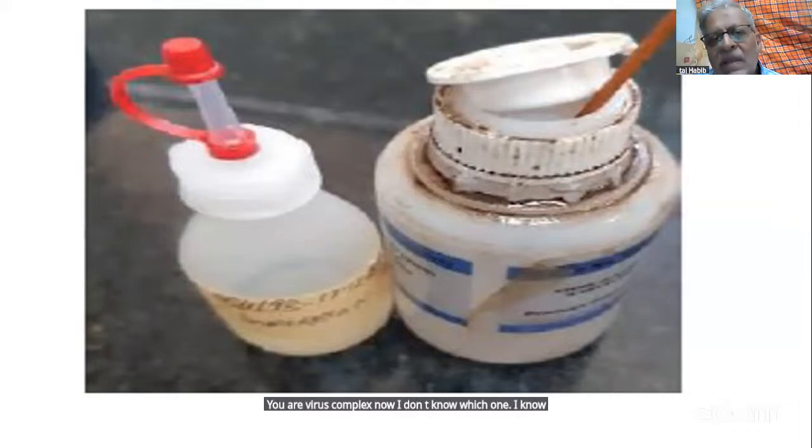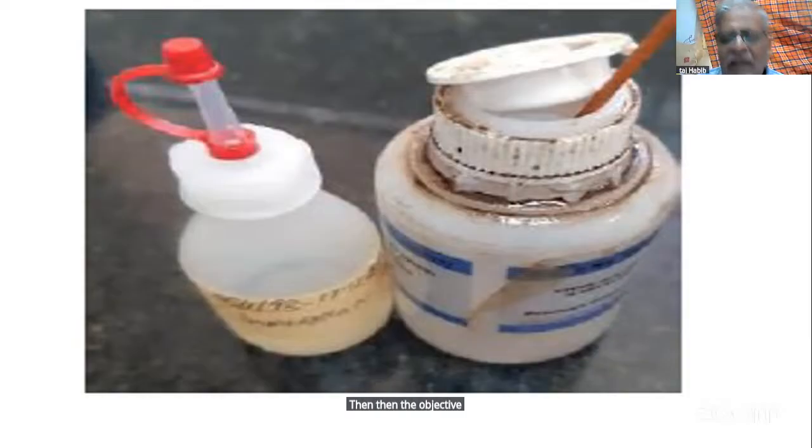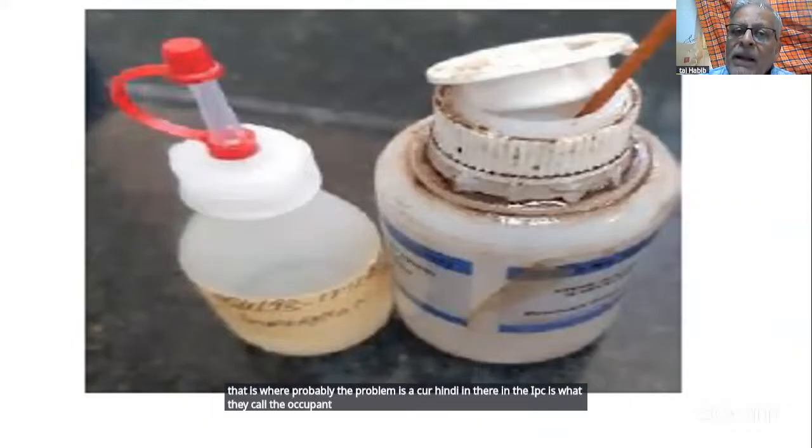Either the eyepieces, there are two lenses in your eyepieces. Then there is the objective. Then inside the objective, there are again some lenses. That is where probably the problem has occurred, in the eyepieces, what they call the ocular. So it is possible that you are not covering the microscope at night. I'm not saying you are being negligent. I'm saying it is possible.